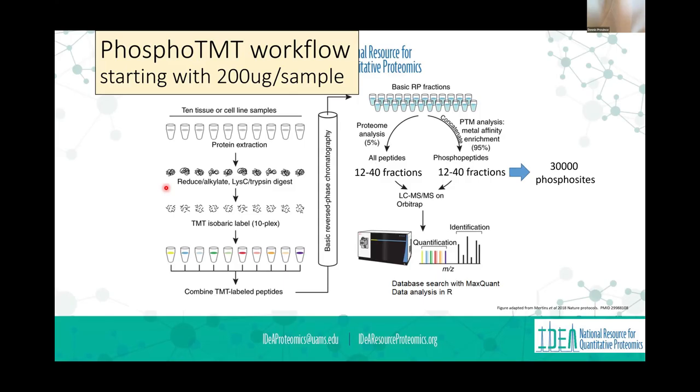We start with 200 micrograms. We request 200 micrograms of lysate for phosphoanalysis. And this is twice the amount of protein that we request for a normal lysate. But the biggest difference is if we just do a normal lysate with 100 micrograms, it's easy for us to process. We're going to digest it all. I'm going to take half of it and fractionate it, and I'm going to take a small percentage of that and run it on the mass spectrometer. We're going to end up running about 1% of what you give us on the mass spectrometer.